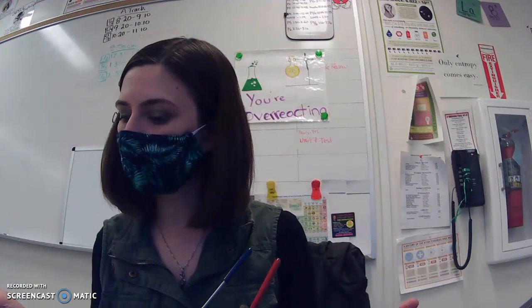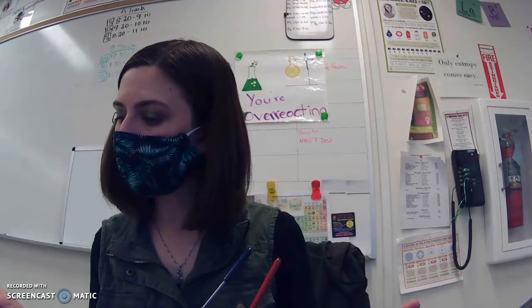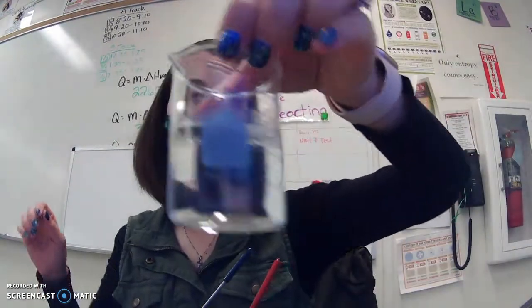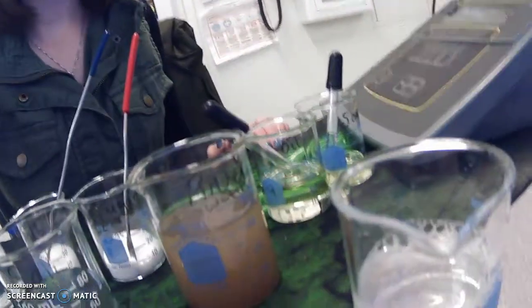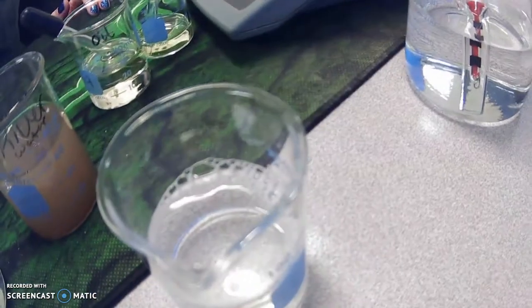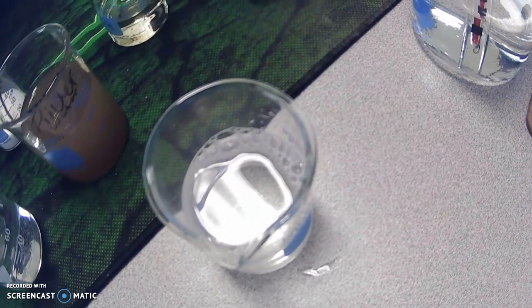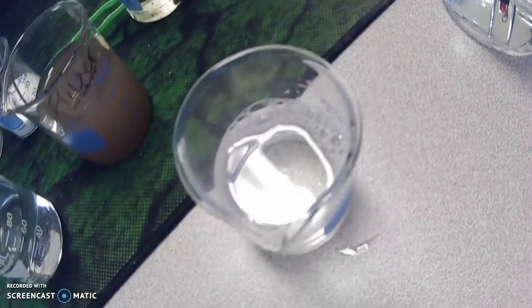Do you see any signs of oil in the water? What do you observe if the oil is present? So here we have our oil mixture. Do you see any oil present here? The bubbles on the outside are from the soap. So is there oil present? I don't see the same little bubbles that were there before in the oil and water mixture.